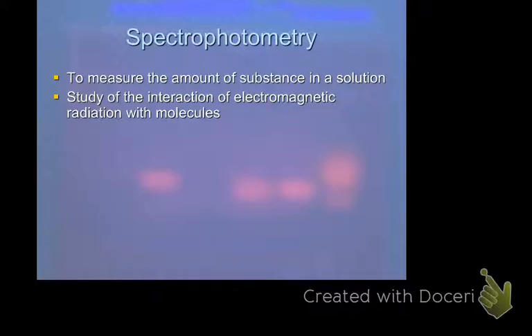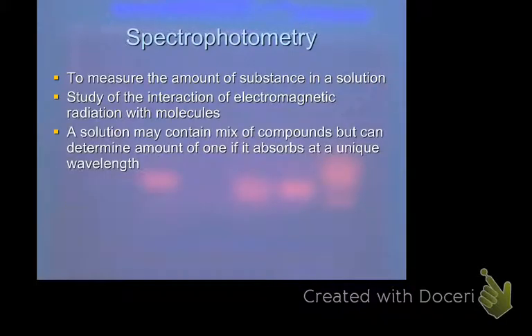So for example, with radio waves, it's NMR, nuclear magnetic resonance spectroscopy. IR is another type, that's IR spectroscopy or spectrophotometry. You have the UV-vis, which is visible light or UV light, and so on and so forth. You can technically even do different things with X-rays and EPR and things like that. But what you're looking at is that at different wavelengths, you can pick up different things. And for proteins, typically we're talking about things in the UV-vis. So you can just use a normal spectrophotometer. Okay.